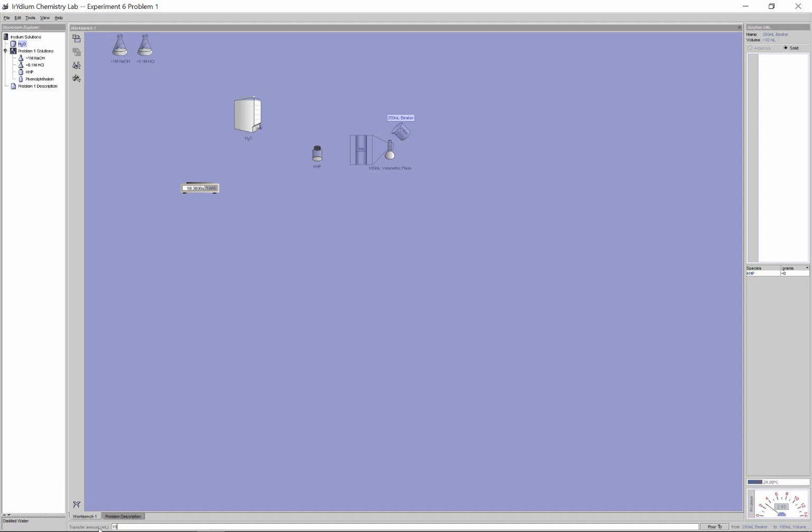Let's tell it, pour it 10. No, there's still more there. Pour it 10. What I want to do is I just want to make sure all those rinsings are under the 100. Because once I'm in the volumetric flask, I can slowly add water to this one here. I don't want to overshoot this line here, because if I get it too high, then again, I don't know the concentration really, really well. So far I've added in roughly about 80 or 90 milliliters.